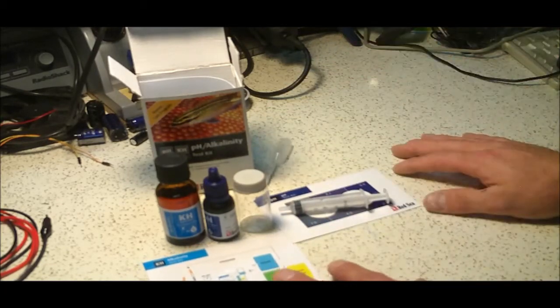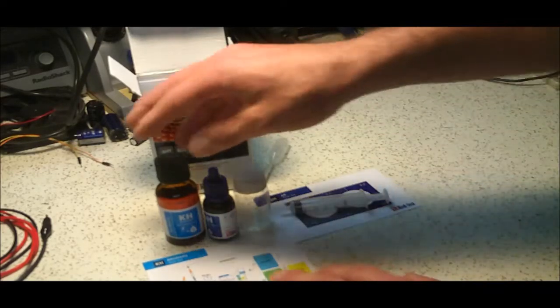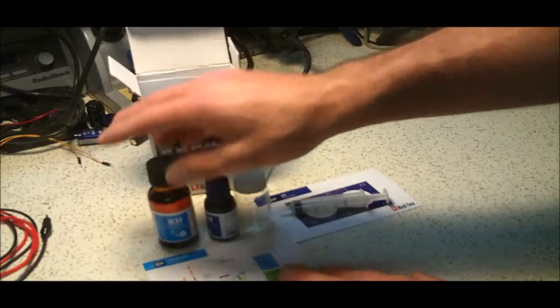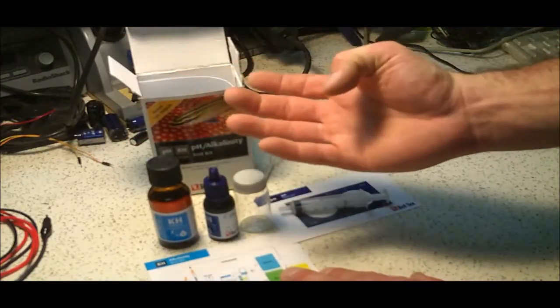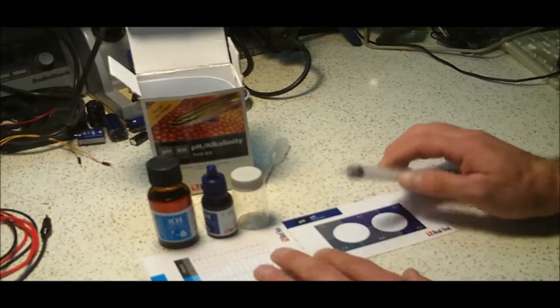If you already have a pH controller with your Apex or Neptune, my advice to you is get the alkalinity pro. You get the nice handheld titration, the wheel that you actually spin and get the color, and that's the way to go.